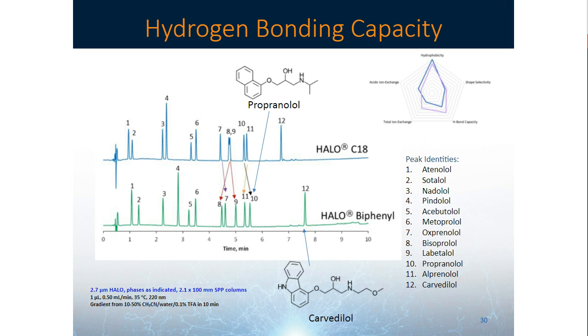And the same thing for the last compound, compound 12. It's more retained on the Halo biphenyl phase compared to the Halo C18.